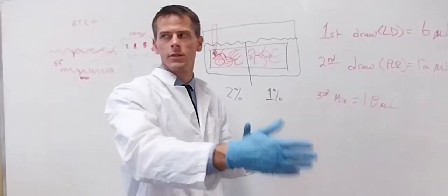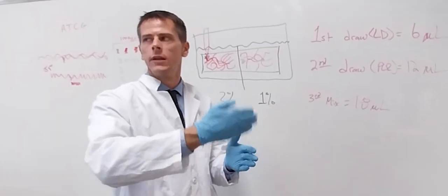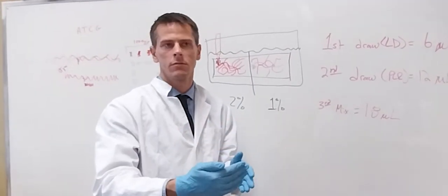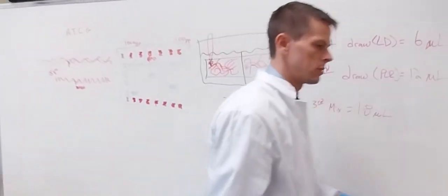So go through, load your six dyes first, and then one at a time, PCR product. Yep, that makes sense. And make sure you change tips between things. This is where you can waste as many tips as you need to.